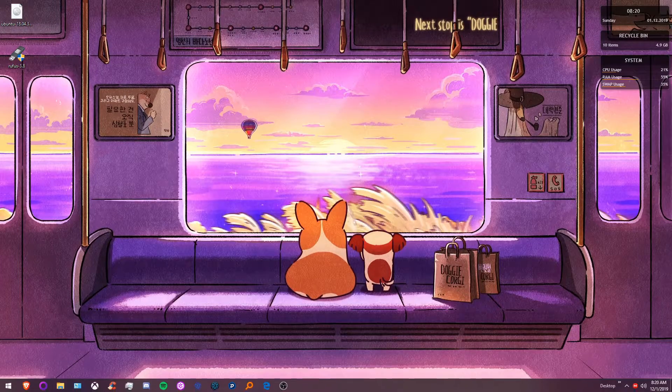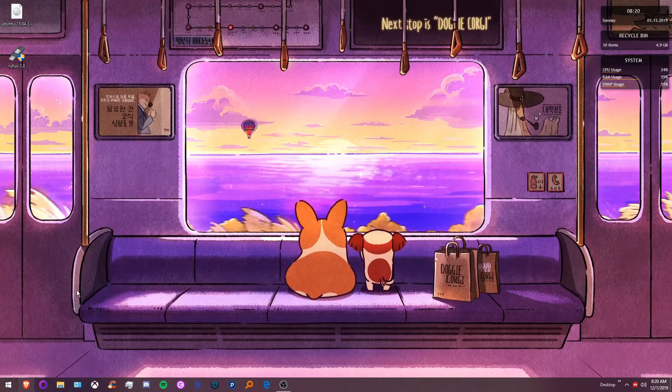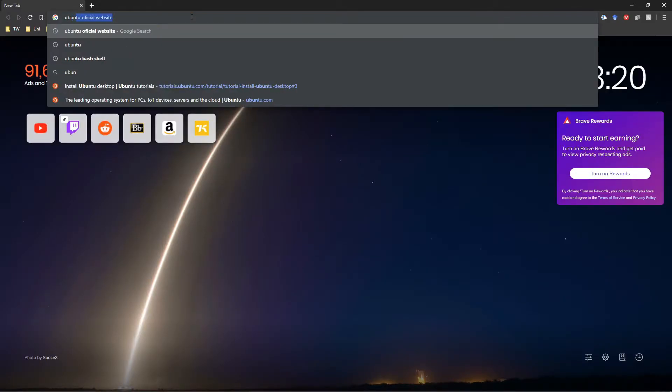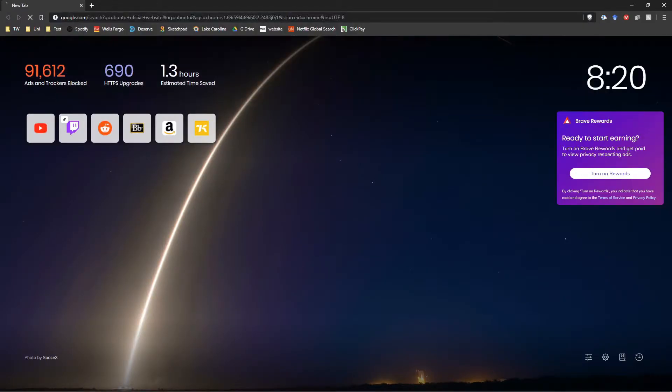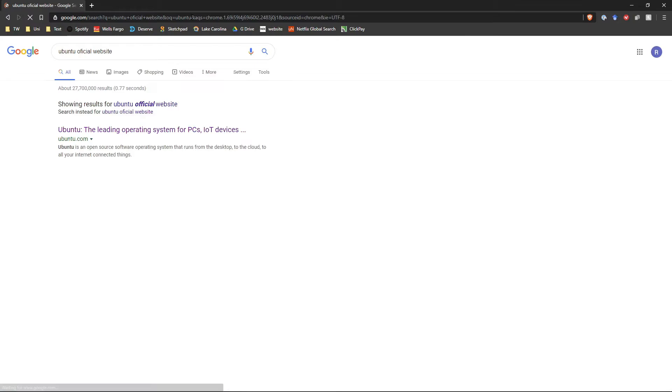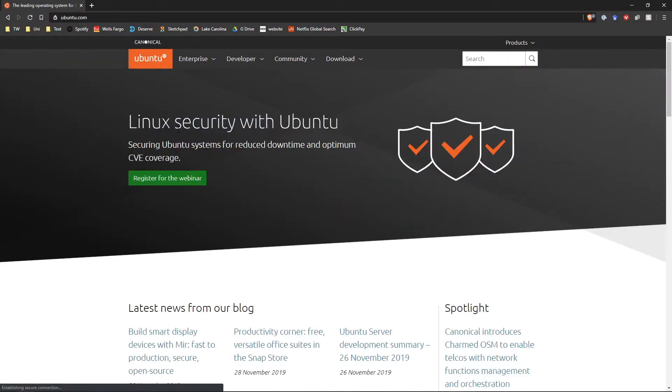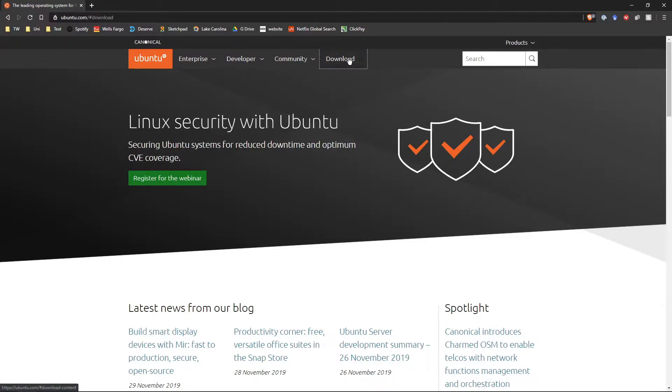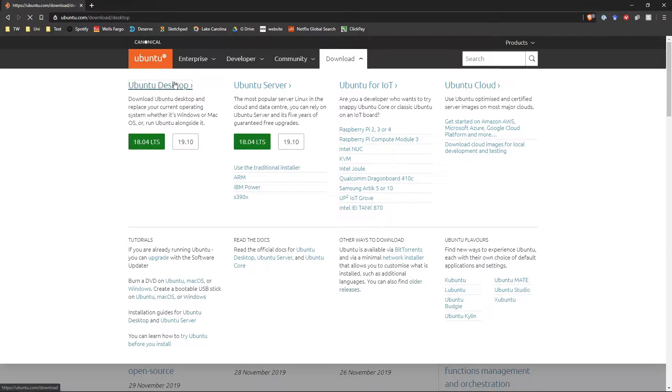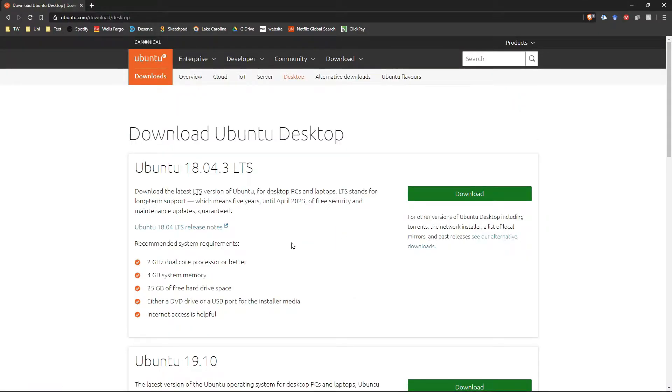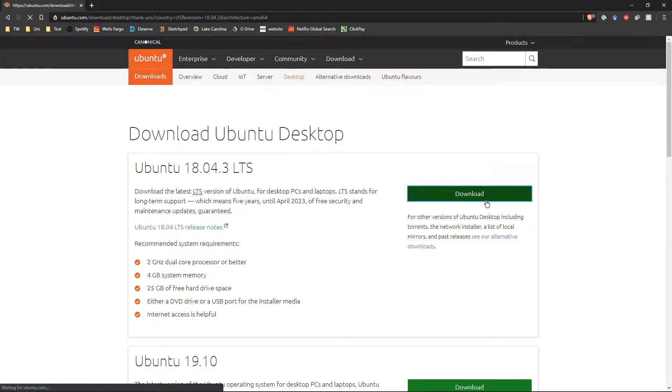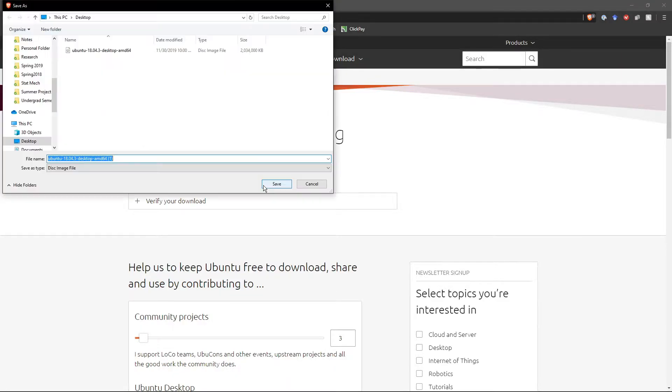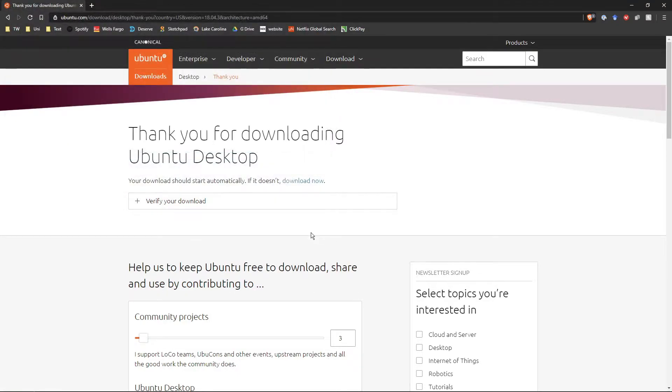First let's go to the official Ubuntu website. So from here you try to download the latest most stable operating system version which should be this one. And we are just going to put it on desktop. I am not going to do that since I already downloaded this.